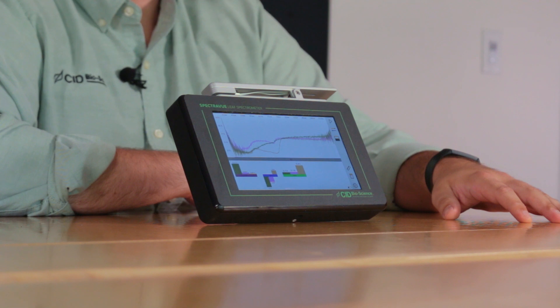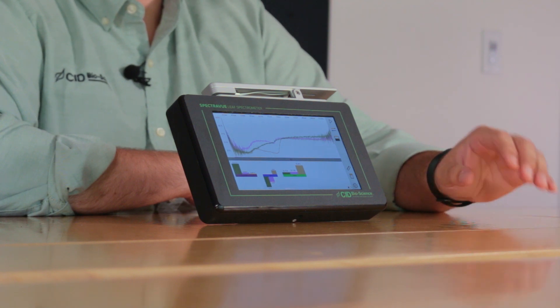Along with the capability to measure simultaneously in absorbance, transmittance, and reflectance, the instrument boasts a spectrometer with a wavelength range of 360 to 1100 nanometers.